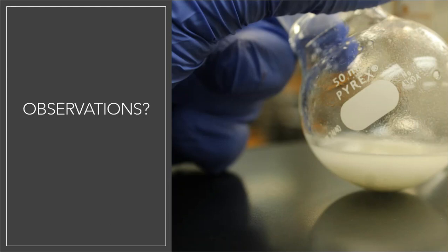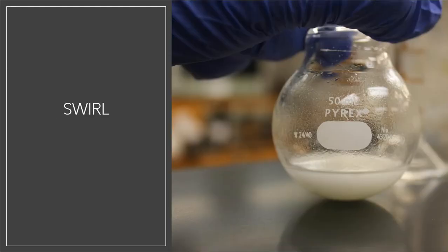Just to make sure that I did give this long enough to mix, I did continue to swirl it, continue to mix it for 1 or 2 minutes, give or take a little bit. That way you can see if anything else changes as far as the observations go. So this is what it looked like before I put it onto the apparatus.